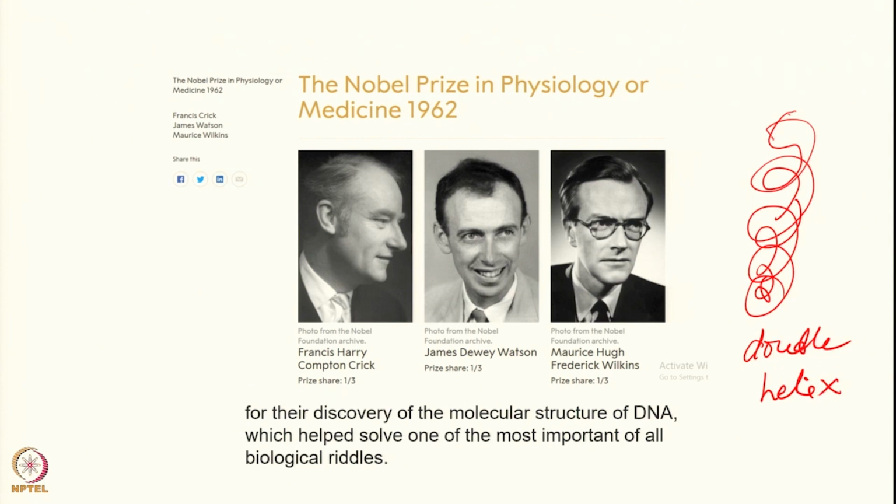We are going to look into all of those, but they based their arguments on the fiber diffraction data. Okay, fiber diffraction does not give you very high resolution. At the atomic resolution it does not give you that information. It only gives the kind of symmetry elements. What are the kinds of symmetry elements in the molecular structure? Either it is proper symmetrical spacings of certain atoms, certain spacing of certain groups, what kind of structural elements may be present inside the big polymer, because you remember this is a very big polymer.